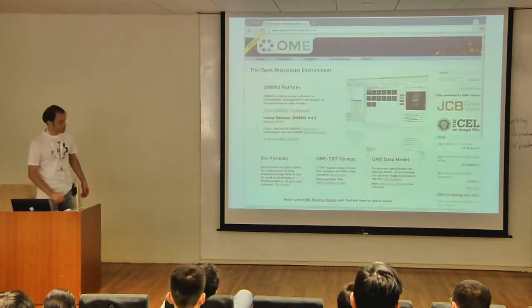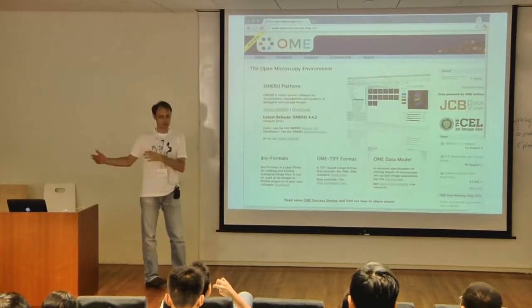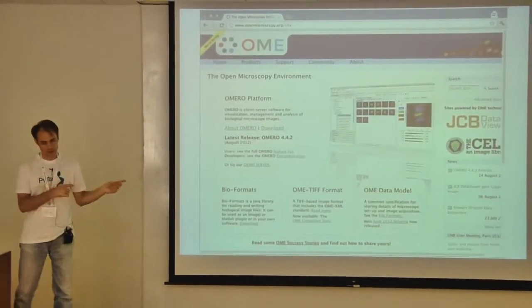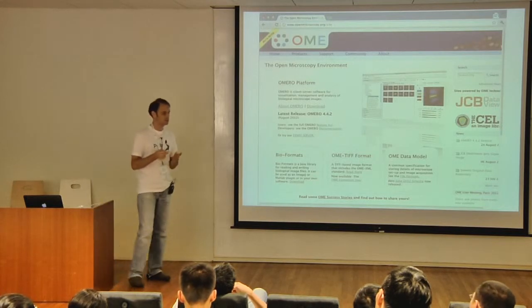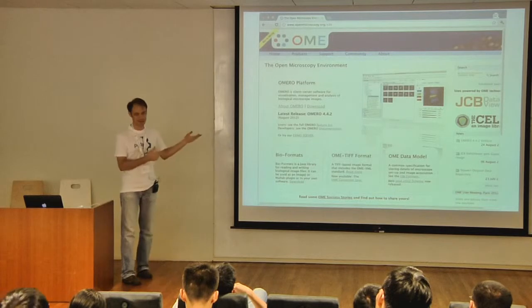So the problem with national level projects is that they are too big, and most IT departments don't have time to connect things and make it happen at a university for some reason. But for specialized tools, like this tool, Open Microscopy Environment, a tool exists. It's a desktop application. It's a web application. There's a database backend. It's basically a LAMP stack.